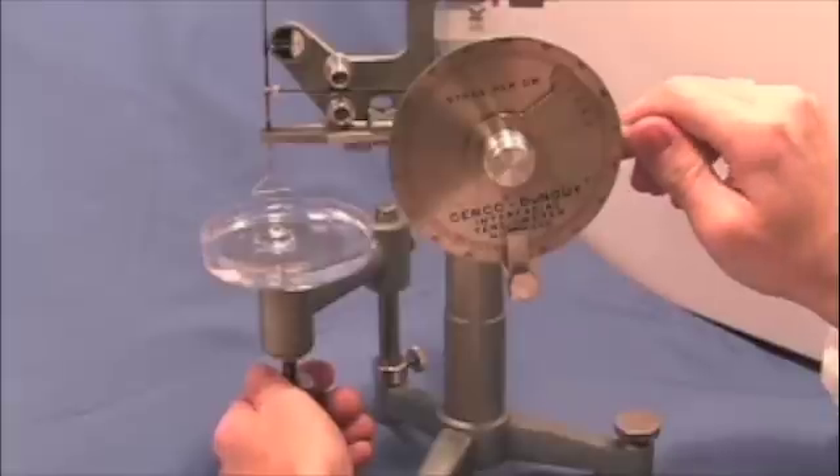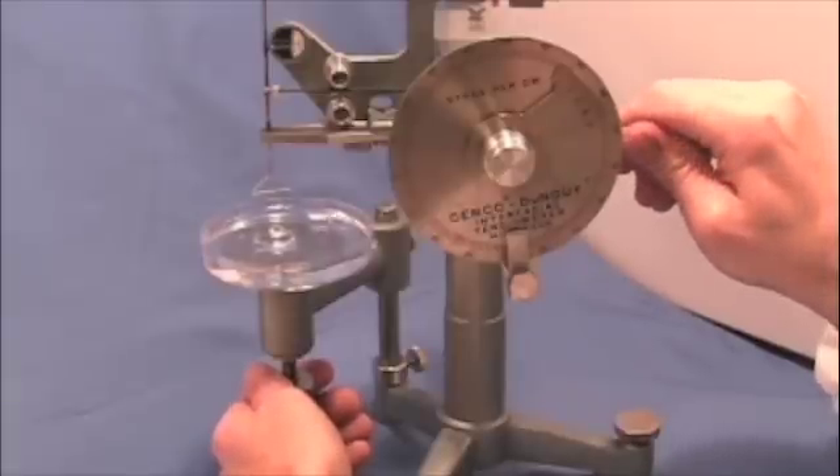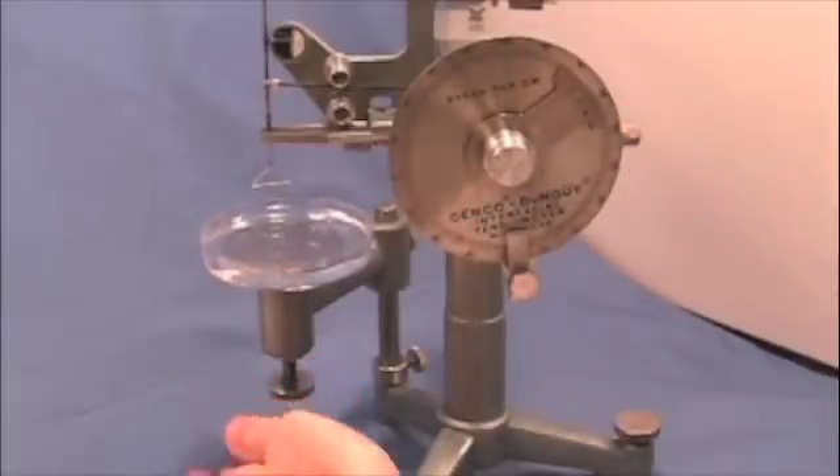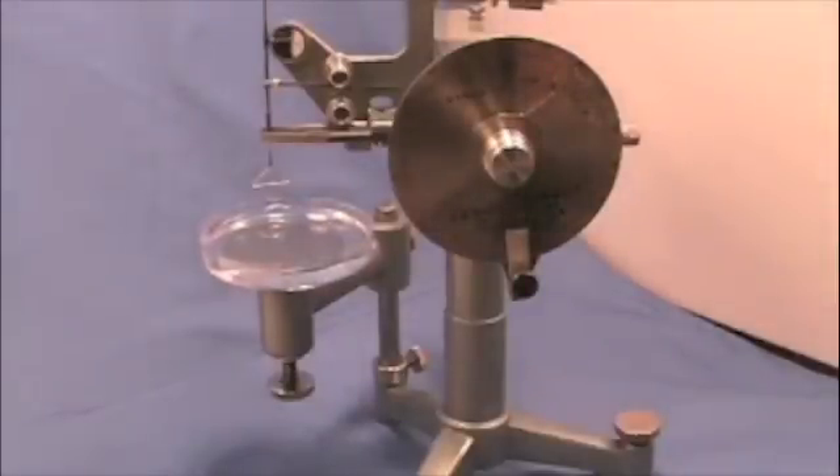We're getting very close to the breaking point, so going in very small increments. Adjust again. Now if we read the gauge, we're looking at a surface tension of about 77 dines per centimeter for distilled water.